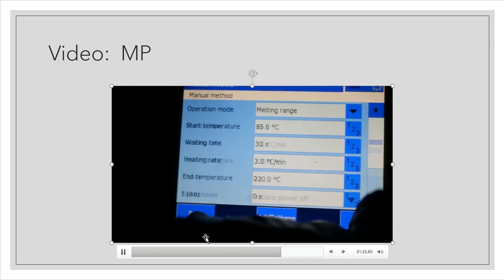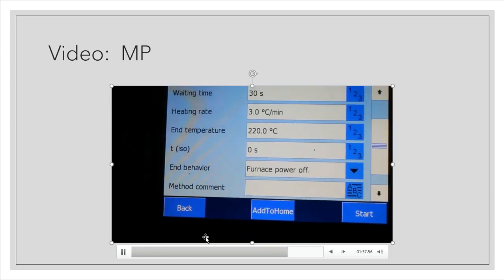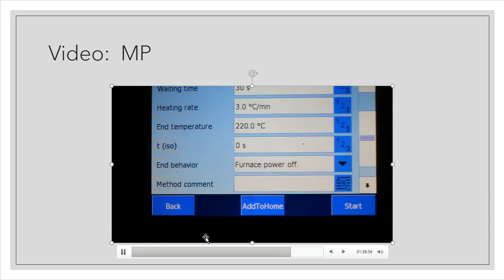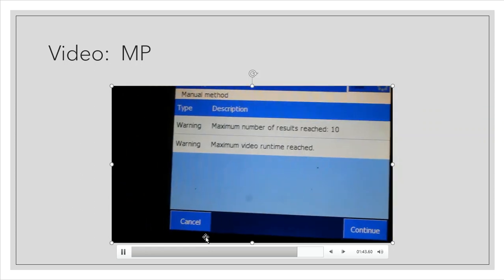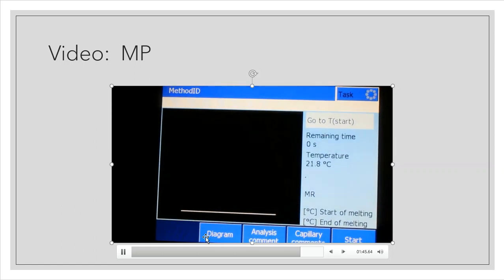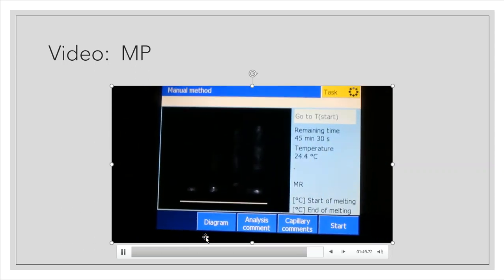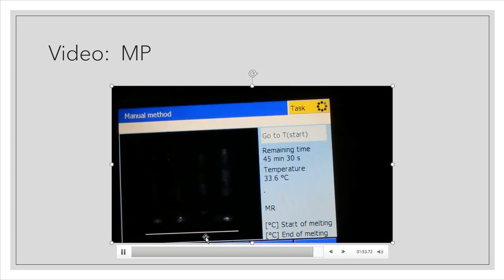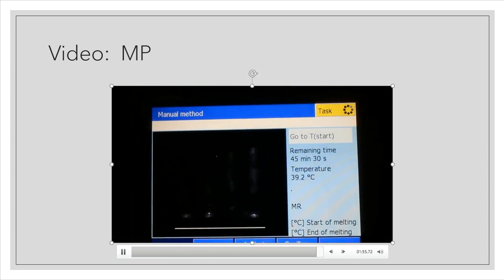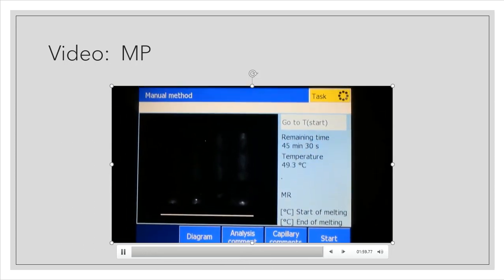And then finally, down here at the bottom, toward the last couple of sections, it's going to give you some fields that you do not have to change and you do not have to mess with. At this point, I'm going to hit start. And again, it's like preheating an oven. I'm going to let it heat up to 85. It will beep when it's ready. That's when I'll put my cake in the oven to bake it. And that's when I'll put my melting point capillary tubes inside of the instrument.